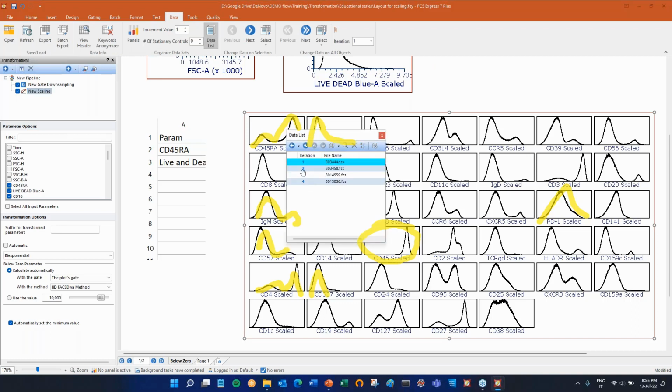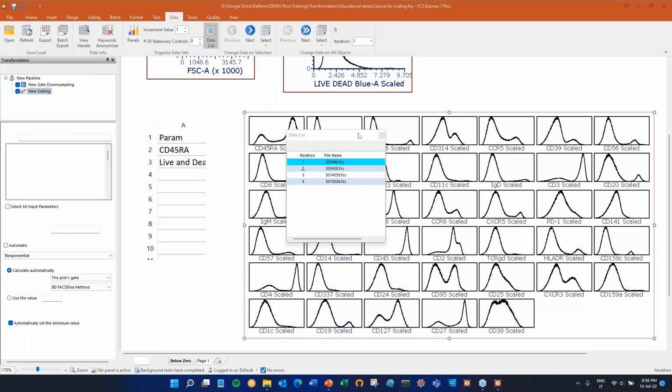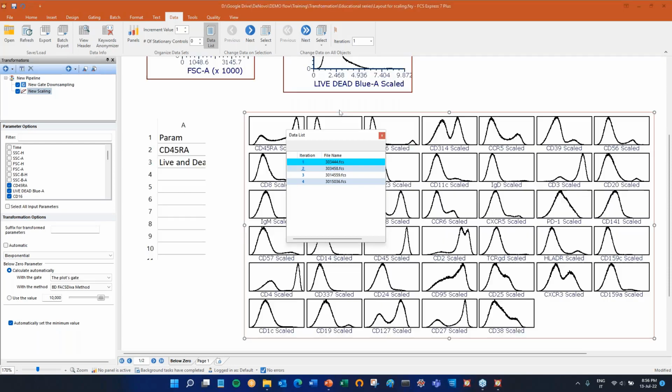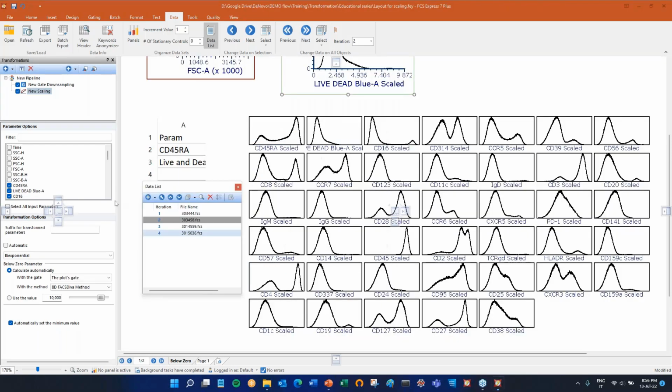Let's see whether sample 2 is also scaled properly with this. Sample 2 is going to be loaded and scaled. This is like half a million data points. Here we go. Now we are also screen sharing, so it's not the best scenario. It's fine. You see, also for sample 2. So the idea is that you will check all of them and see whether it's fine.